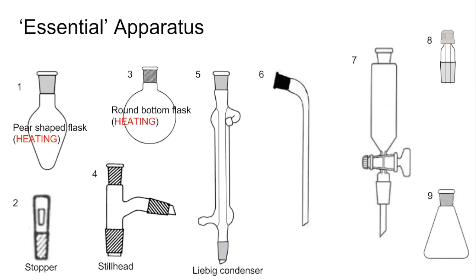Number five is what we call a Liebig condenser. If you're wanting to attach a Liebig condenser to a pear-shaped or round bottom flask in the distillation position, you attach the condenser to the flask via the still head, which would go in between. The condenser attaches here, and you could put a stopper or a thermometer in to seal up the apparatus.